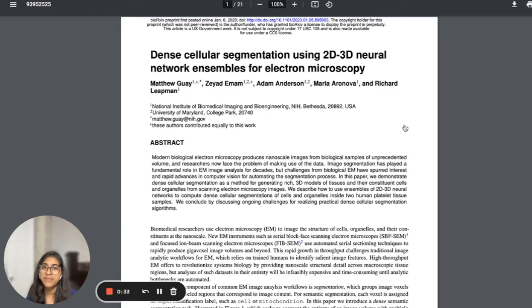So I was like, you know what? Let's take this a level up and now do 3D segmentation, which in this case is not a completely 3D segmentation model, but there's parts of different models that it uses to outperform the baseline models, such as the 2D UNet for segmentation, the 3D UNet, the DeepLab V3, and other ones. So let's get into the paper.